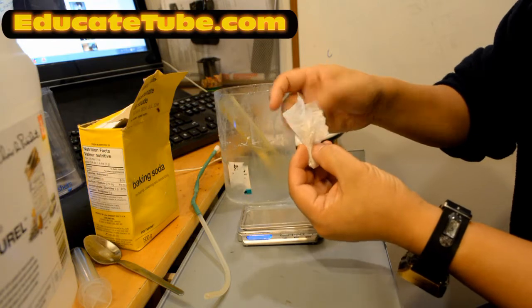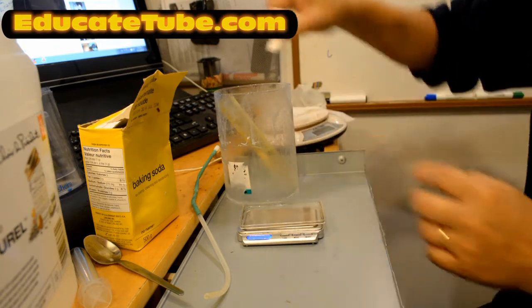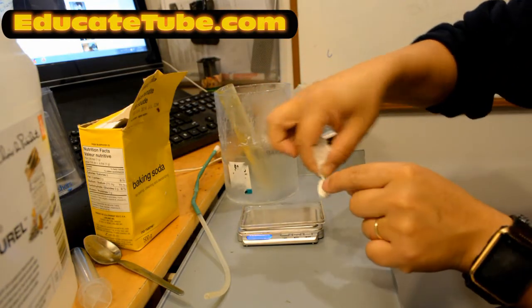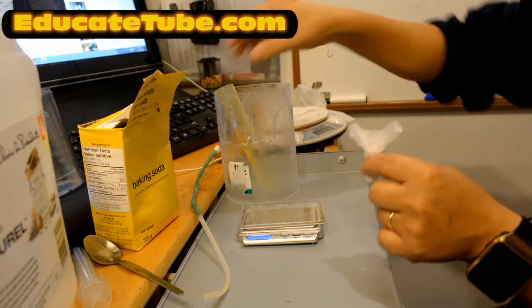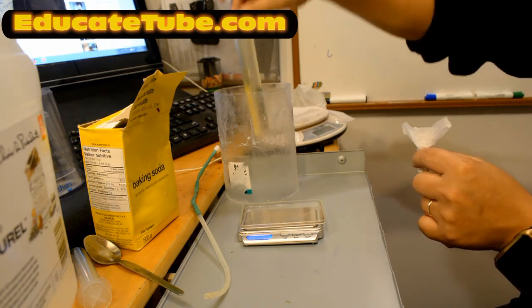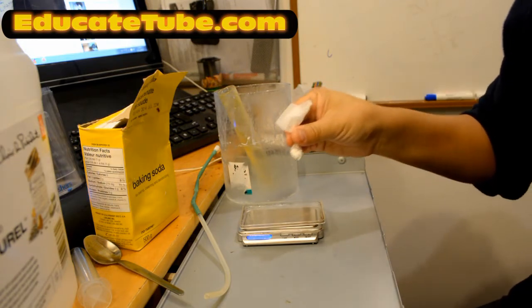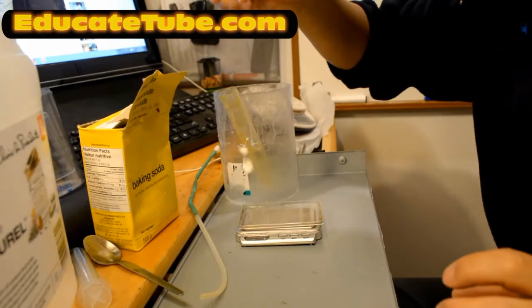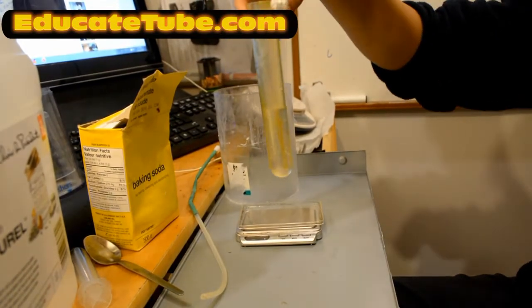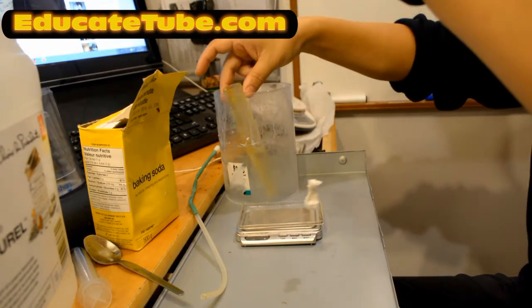And what I'm going to do is put this inside the test tube when I'm ready. I need a string to tie on top of here, and I'm going to lower it down into this test tube reaction chamber where this acetic acid is, and then it should react. I only want it to happen when I am ready. So here's a string attached to the tissue of sodium bicarbonate. We are going to lower it into the acetic acid like this when I'm ready. So it goes in there and reacts, and then we can monitor the bubble that's produced.